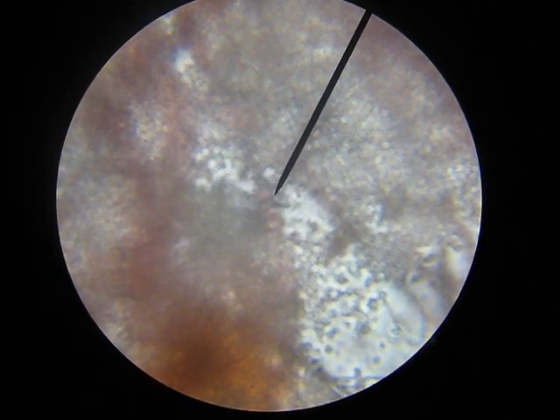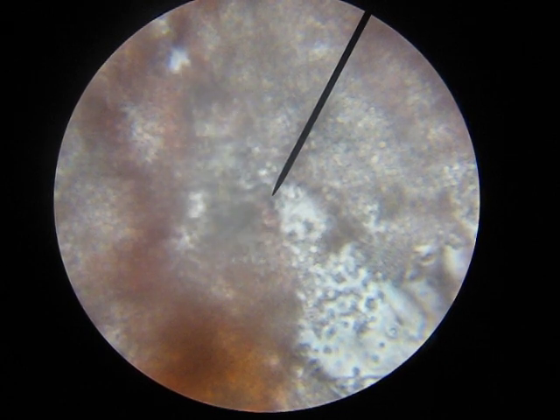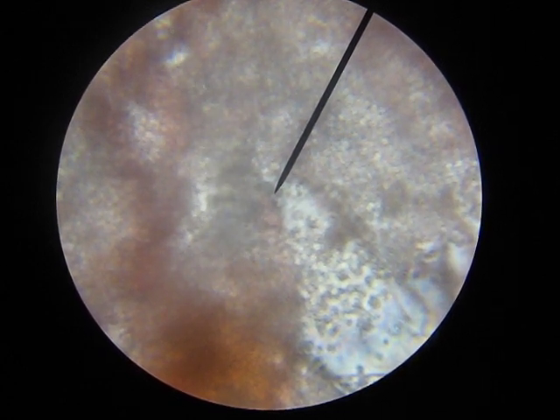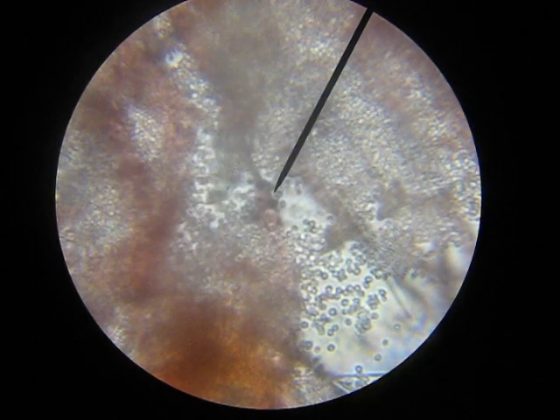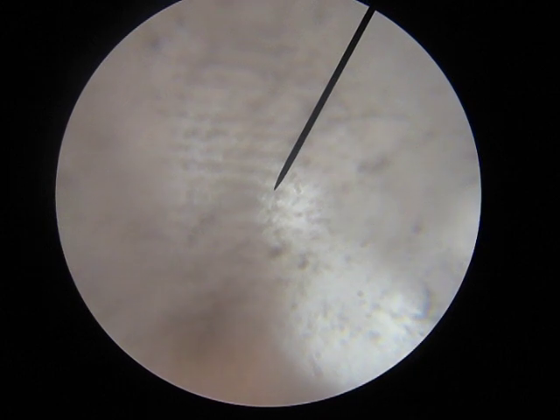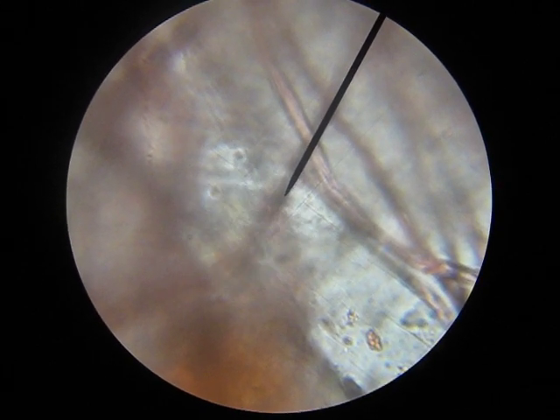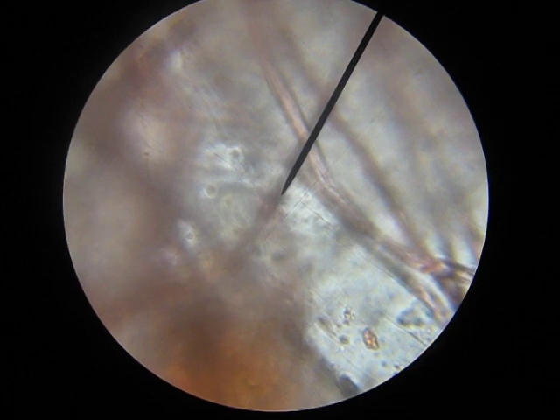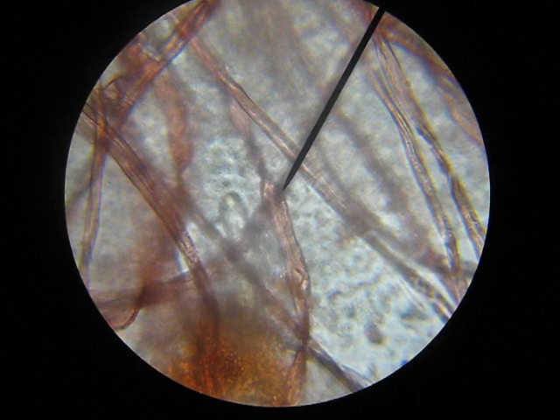Maybe there. Let's see — maybe even the coarse focus, just a tiny bit to see if we could get more of its shape. Up or down? I'm not sure. Let's try one or the other. Maybe the other way. No, not that way. Right in there was really good — a little bit more. Yeah, there.